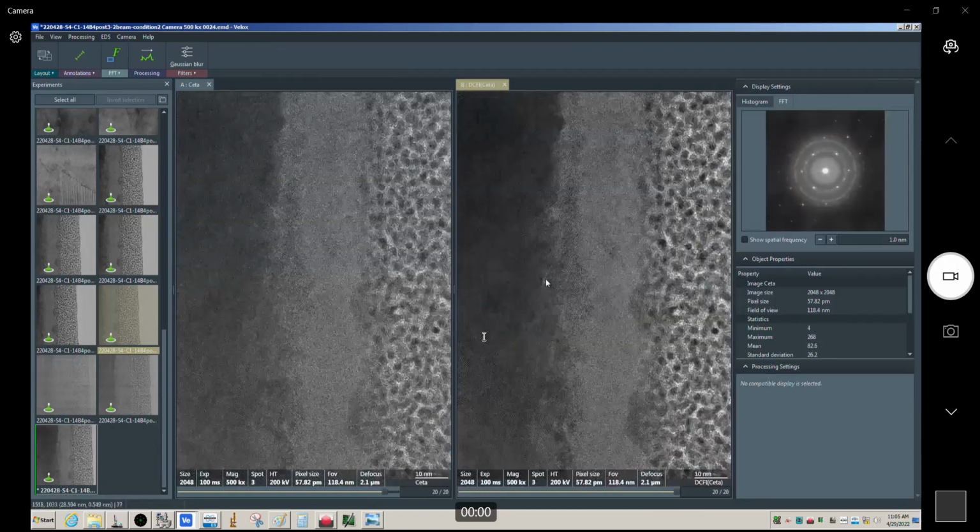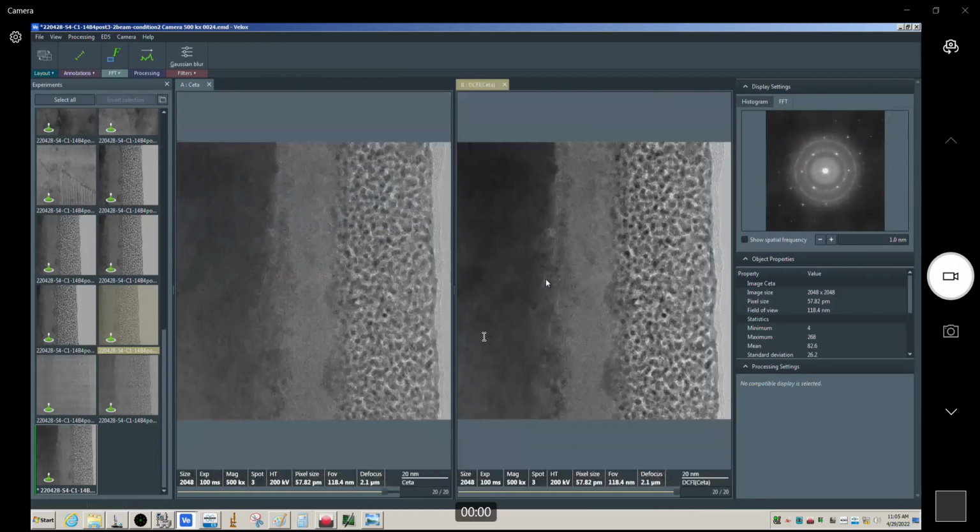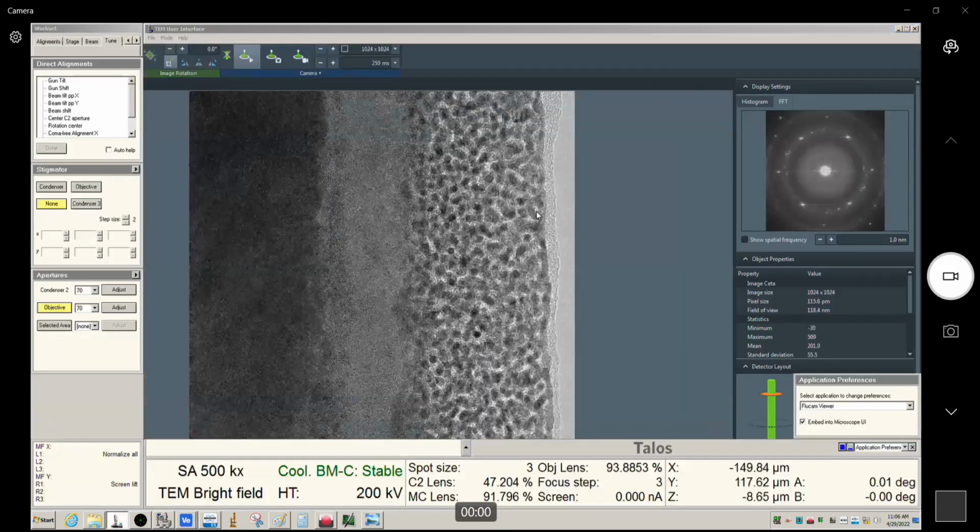The one thing you can see here in the FFT, around the edges, there's a little bit of patchiness. That is from the alignment process of the frames. But what you don't see is the diffuse signal having chunks of it missing. So that's good. That means the summation, or the alignment of the frames, was correct. Okay, so that's the frame integration.